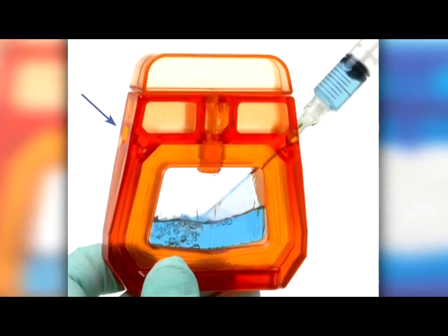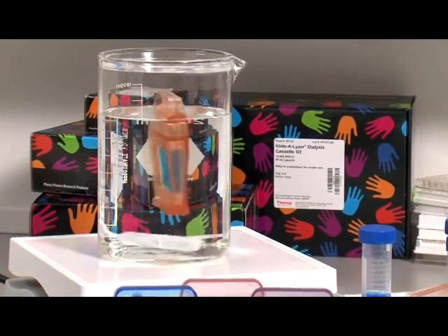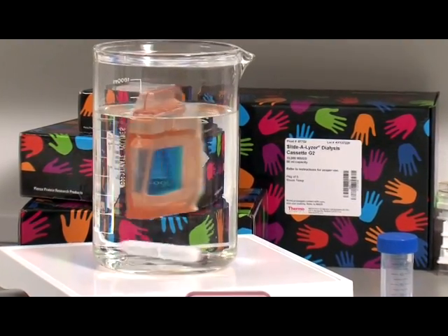Of course, if you prefer, Slide-A-Lyzer G2 cassettes have two syringe sample ports.